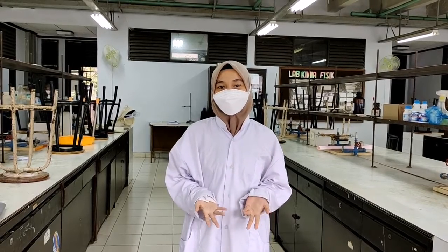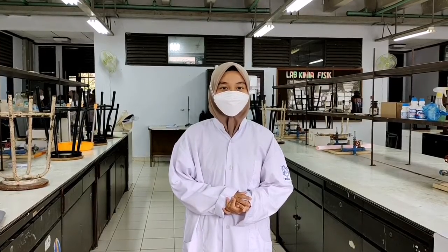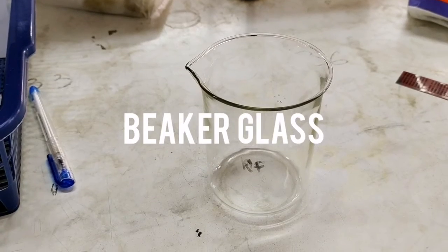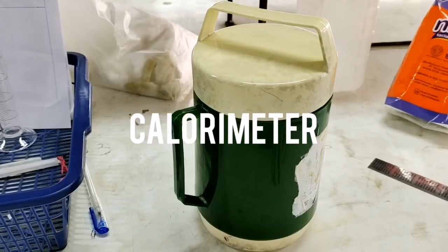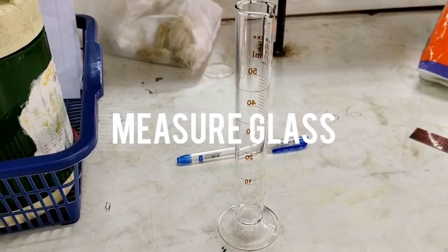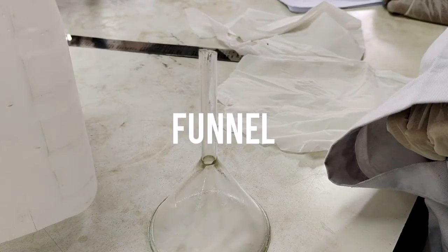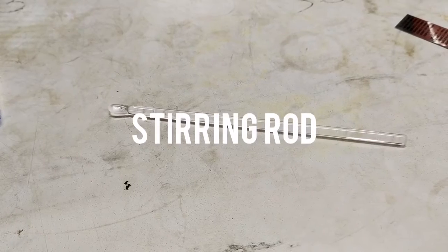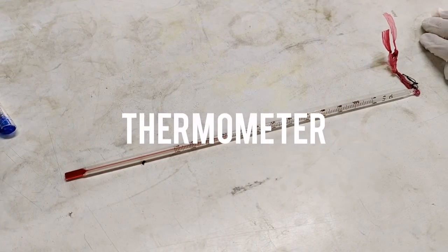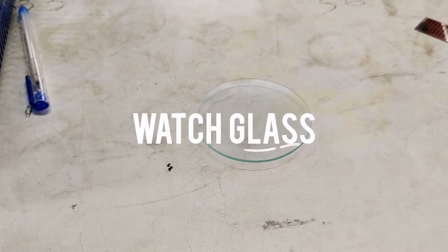Before we get into the experiment, I will explain the tools and materials that will be used in this experiment first. The tools used are: the beaker glass as a container for the solution, the calorimeter as a tool to measure heat changes, the measuring glass as a tool to measure the volume of solution, the funnel as a tool to help move the solution, the stirring rod as a tool for stirring the solution, the thermometer as a tool to measure temperature, and the last is the watch glass as a tool for weighing substances in the form of solids.